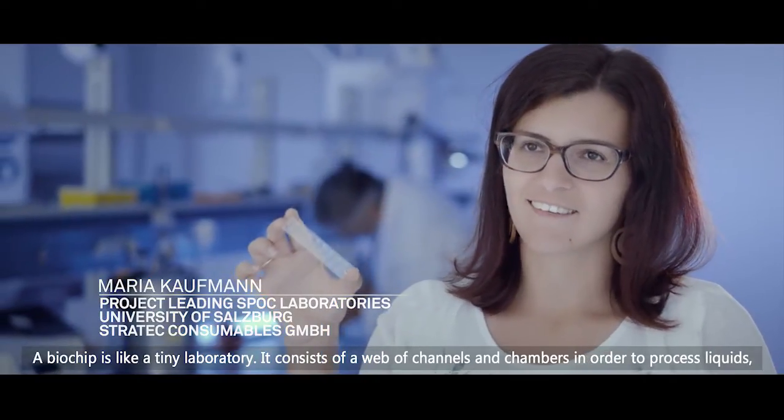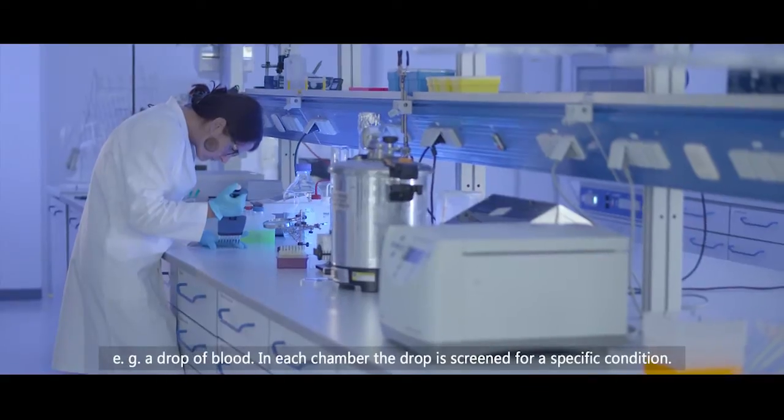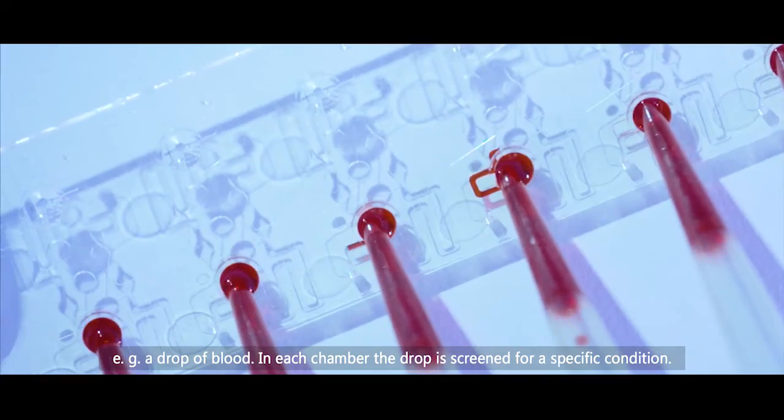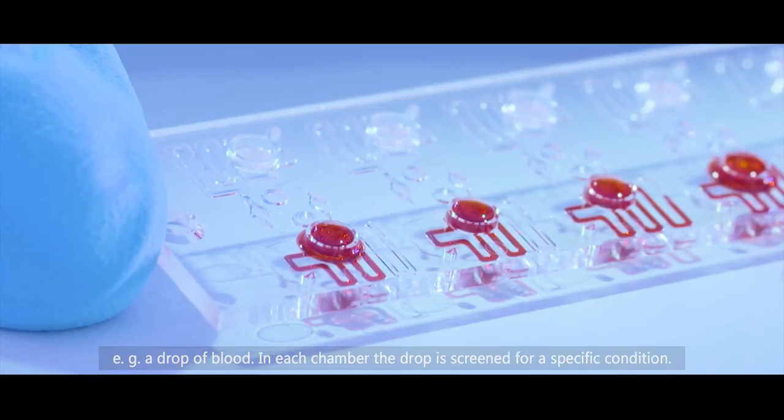A biochip is like a tiny laboratory. It consists of a web of channels and chambers in order to process liquids. For example, a drop of blood flows through it, and in each of these chambers the blood drop is examined for a very specific condition.